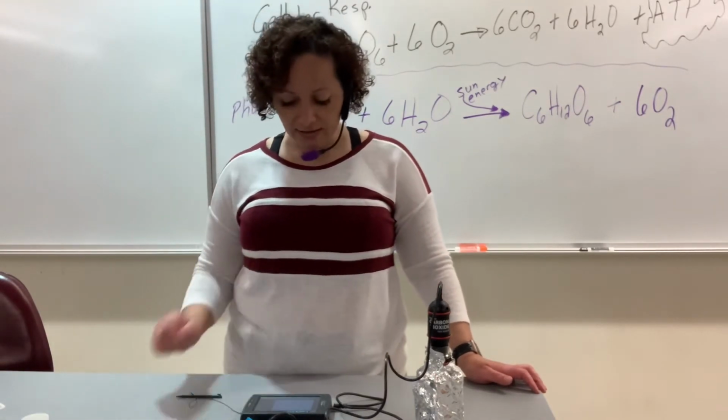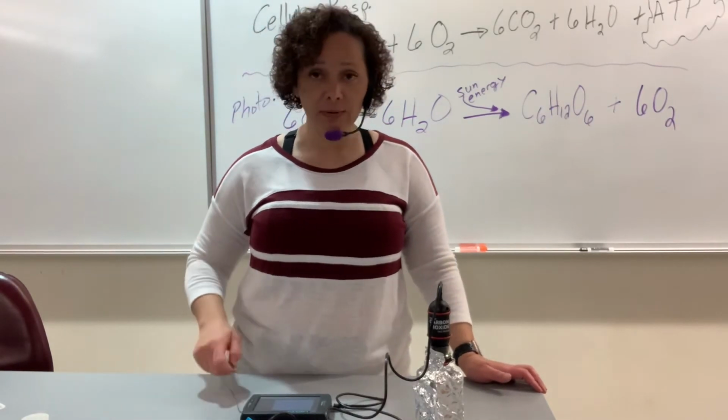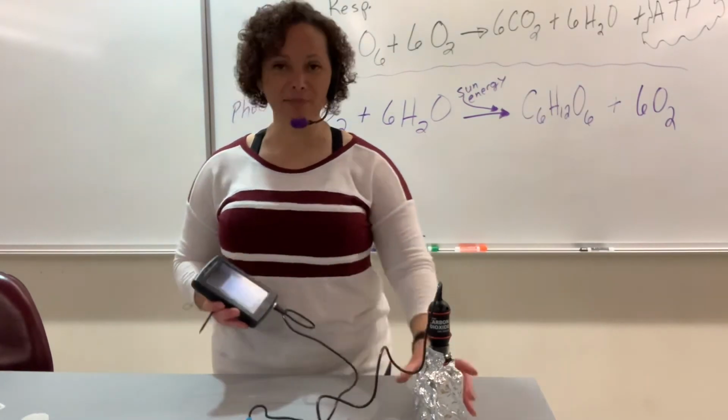So don't hit the stop button, but at the same time, I don't want you to sit here and stare at me for 3 minutes, so I'm going to hit the stop button just so I can show you what's next. Oh, wow. Isn't that beautiful?